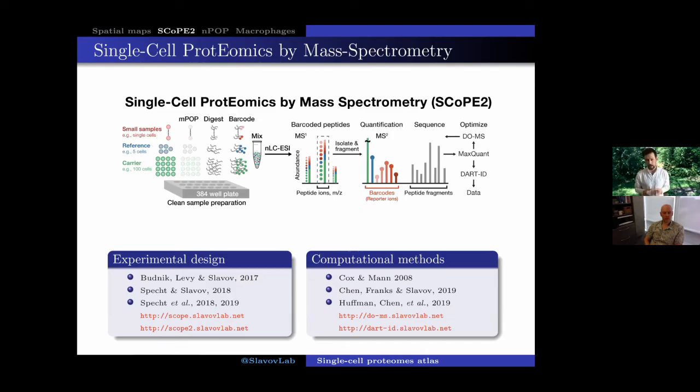As Ryan Kelly already explained, sample preparation is key to generating high quality data. And we have come up with a couple of different generations of sample preparation. The first generation was to use focused acoustic sonication to avoid the use of chemicals that then have to be cleaned up from the samples. That was low throughput and couldn't be automated easily. There was potential to do that, but it was going to be awkward.